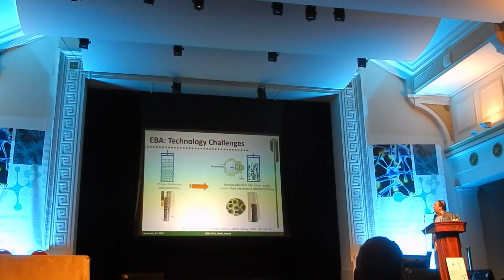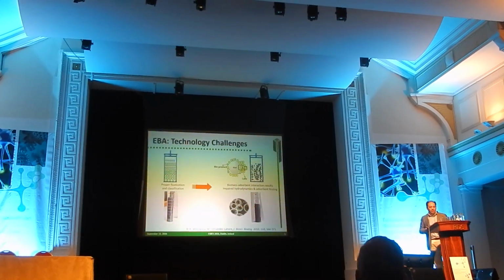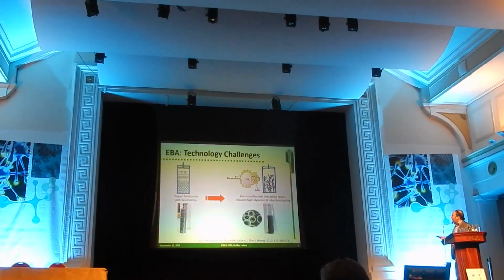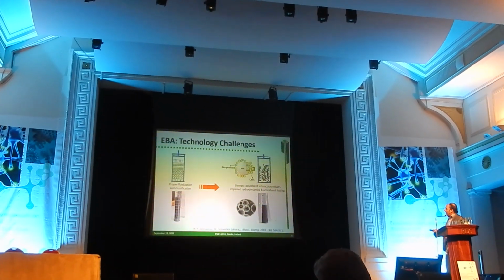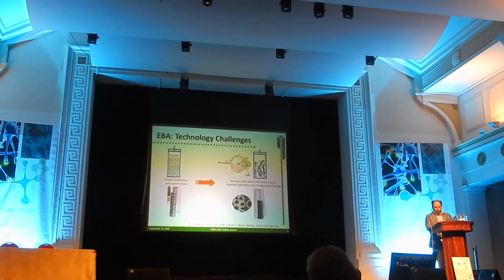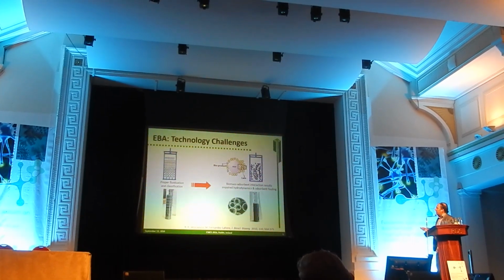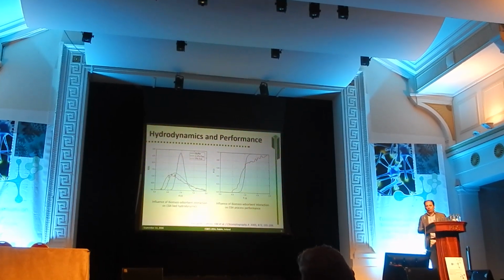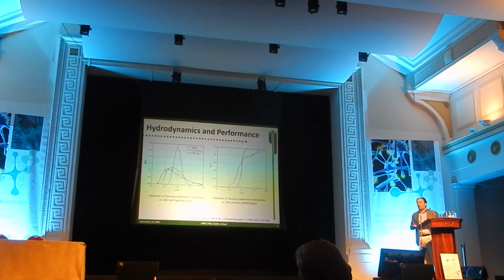and the net effect of this cell adhesion or cell interaction is that the fluidization of the particles and the underlying hydrodynamics within the system become distorted, and you start looking at problems with, for example, channeling and decreased or collapsed beds, right? This is not good for capturing your product, and this can, at the systemic level, be seen by, for example, utilizing residence time distribution analysis and breakthrough curve analysis, which are the tools that we will be using in any of these chromatographic systems.